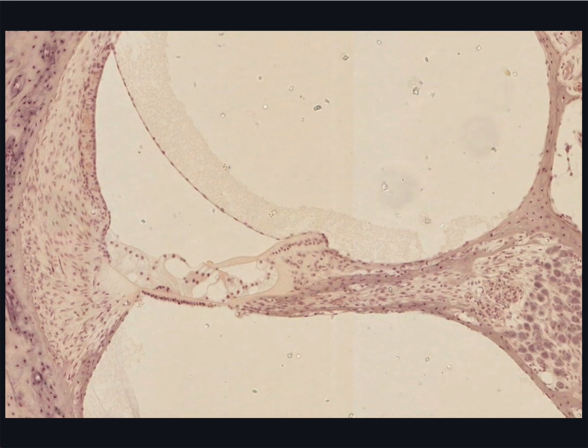And over here is the stria vascularis. And look very carefully and see if you can see capillaries. They're very faint, aren't they? Running in this epithelium. This epithelium is responsible for secreting endolymph.